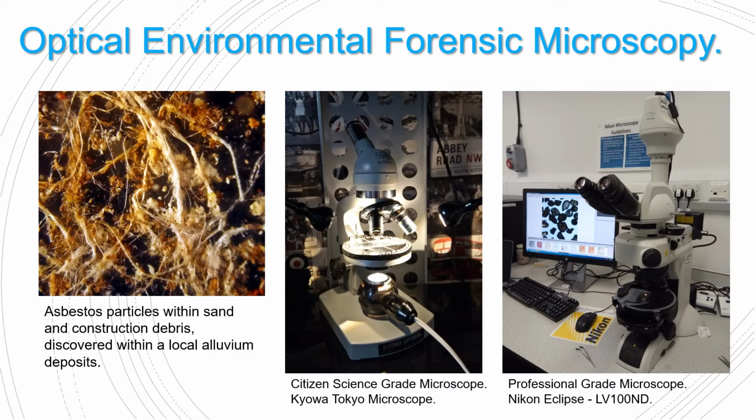So what is environmental forensic microscopy? Well, it's essentially quite traditional methods of optical microscopy with a focus on the initial identification of particles under the microscopes. That's using things like plain light, ultraviolet, what it looks like if you shine a light on it, so that's reflective light, and also putting polarizers like sunglasses over the particles and trying to identify what sort of shape, colors, diagnostic features as well, like does the sample change color. All those kinds of things are really important.